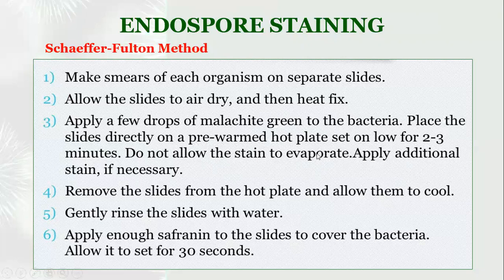The malachite green should not be evaporated, but it should enhance the penetration of the dye into the cell wall. Then remove the slide from the hot plate, cool it, gently rinse the slide with water and then add safranin. Safranin is the counter stain or secondary stain.